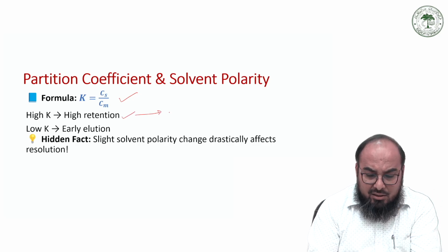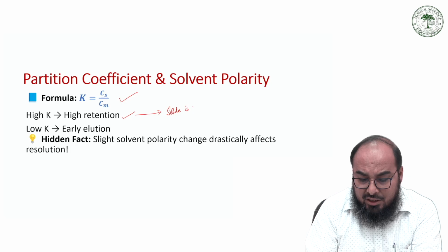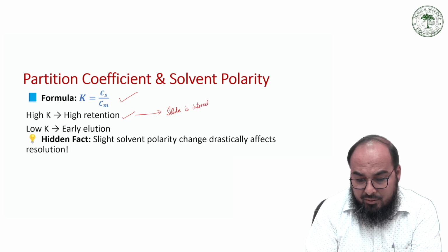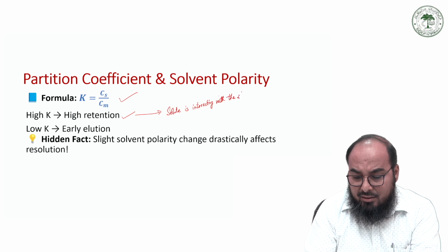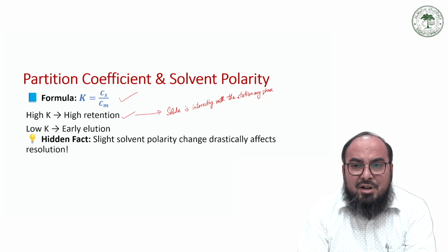That means that the solute is interacting strongly with the stationary phase.